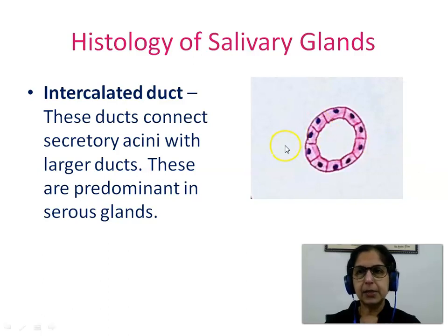This here is a picture showing you the structure of an intercalated duct lined by low cuboidal cells with the nucleus pushed towards the base of the cell.